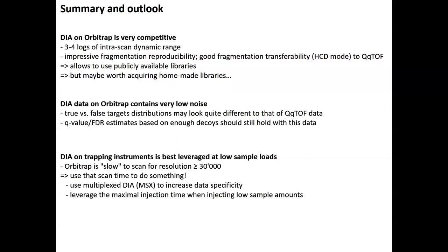Do something with it. I think Mike's group has designed this MSX that you will hear more about on Thursday, I believe. MSX is a fantastic way to make use of this scanning time that is otherwise lost. My personal take is that it allows you to inject very low sample amounts and then fill up and make use of the fill times during the scanning time, when the ions are otherwise completely wasted in the trash.